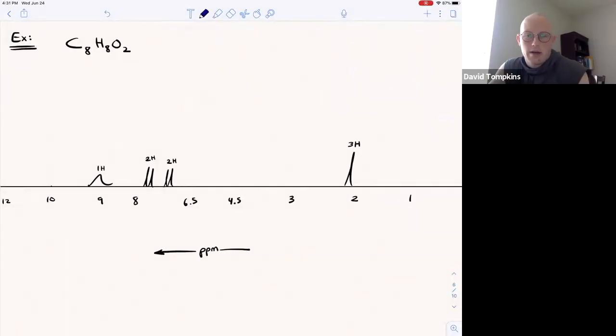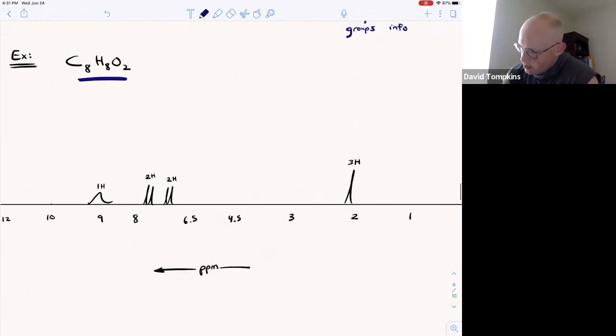In this video now I'm going to apply some of the structural elucidation techniques or steps that we diagrammed in the previous lecture. So starting first with the molecular formula for this unknown compound. To calculate degrees of unsaturation, we say it's 2 times the carbon count plus 2.